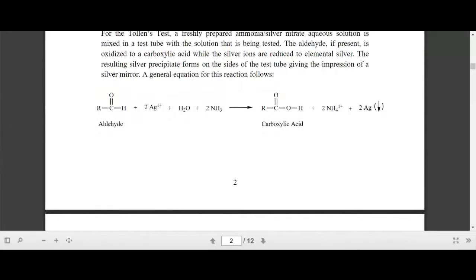So we have 4 unknowns and 4 choices. One will be water, one aldehyde, one ketone, and one methyl ketone specifically. How do we know we have an aldehyde?